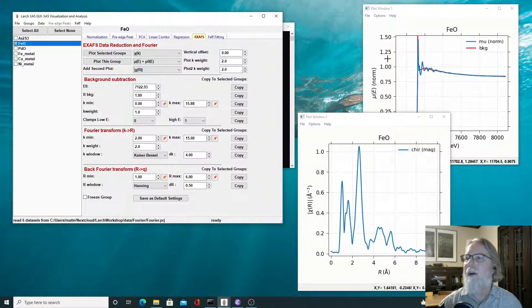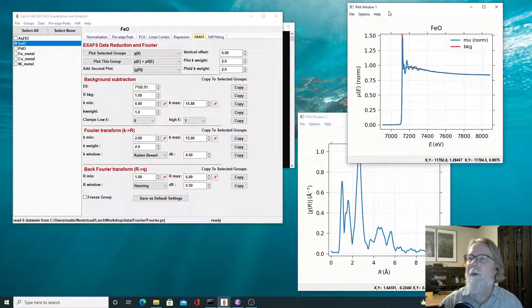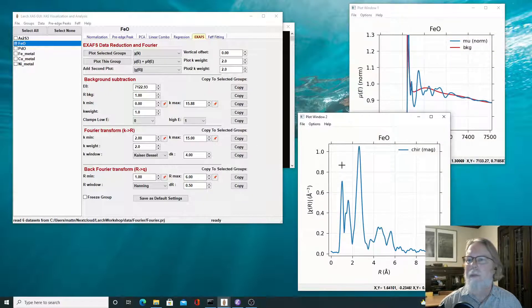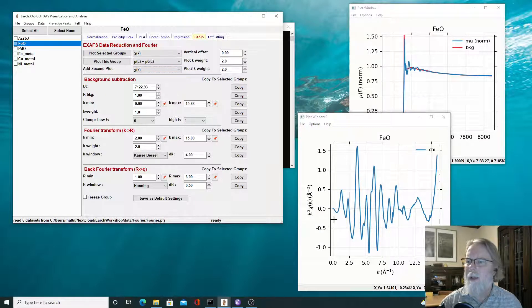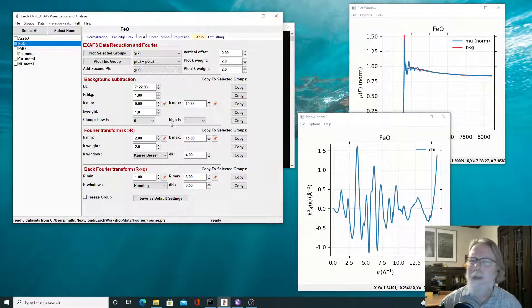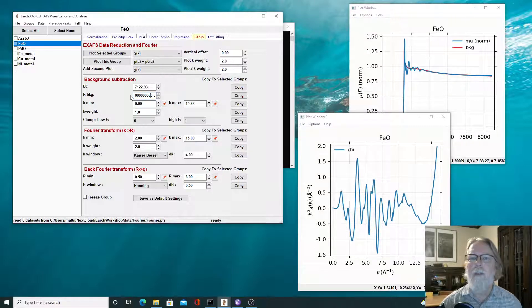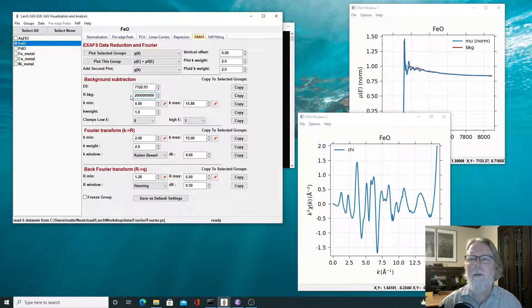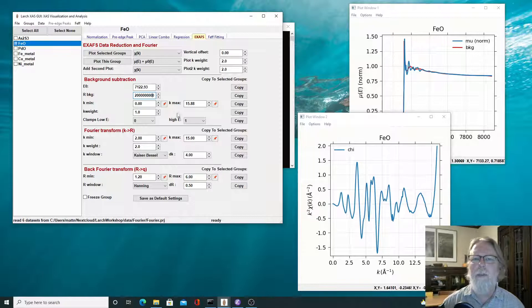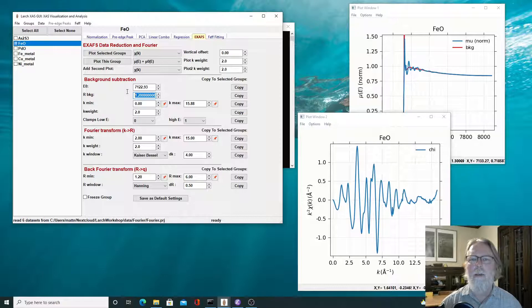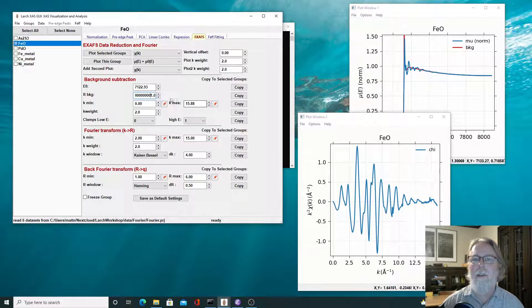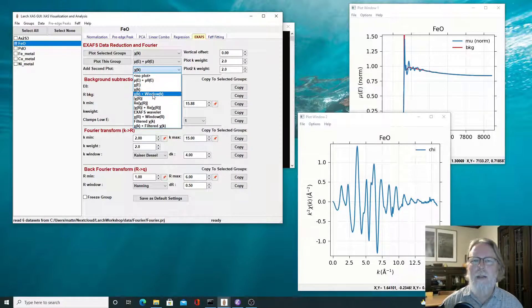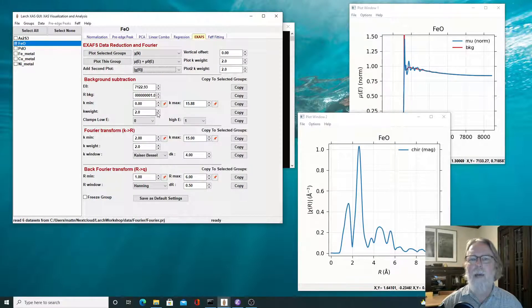So let's just try another data set. Here's some data for iron oxide. And for this data set, we're going to look at another portion of the parameter space. So here, it will blow up again. That's the slowly varying oscillation. This is the resulting XAFS. Let's look at the chi of K data. And there's this sort of swoopy stuff and junk going down there. So another thing we can play with is we can either play with, again, RBKG. So I can make this smaller and that's clearly getting a little worse.